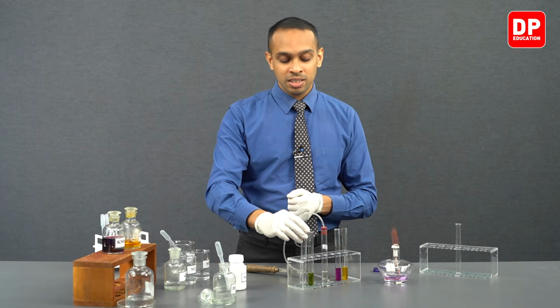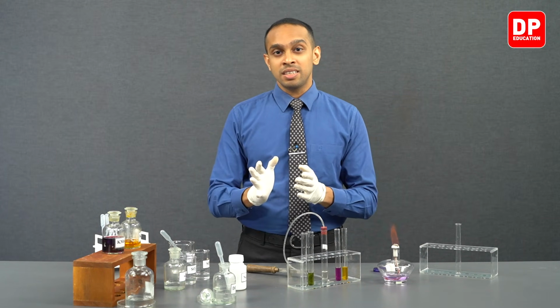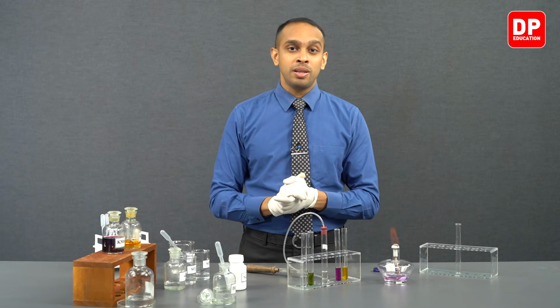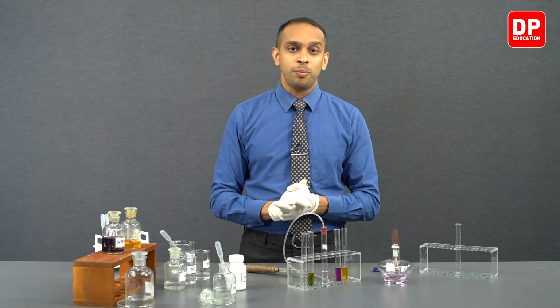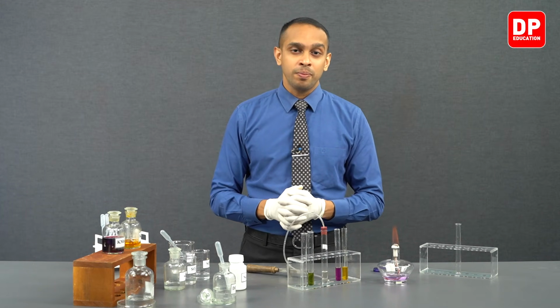So this is a very clear observation that when we add HCl to a solid ionic compound that contains sulfite ions, it will react with HCl to produce sulfur dioxide.